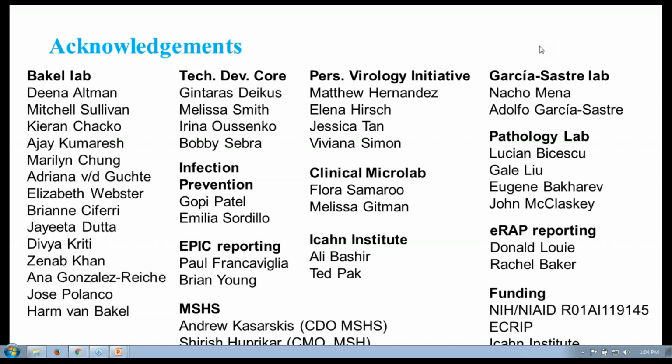But what it's really going to come down to is the ability to get high molecular weight DNA out of your fungal sample. And if you've surmounted that challenge already, then we have lots of options. We have done quite a few fungal projects here at the Genomics Center, and extraction was always the trick. But we have a great extraction team here as well, so we'd be happy to work on that for you.